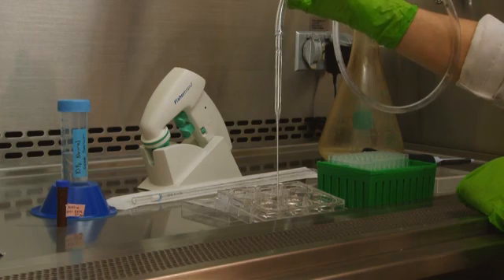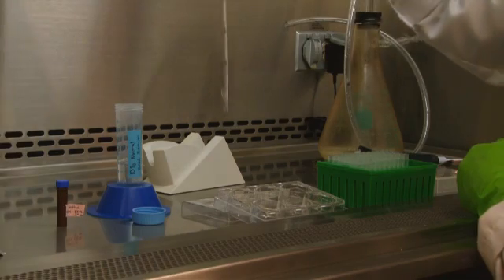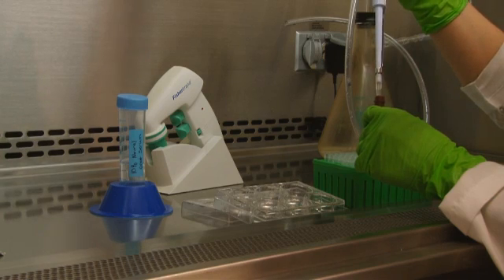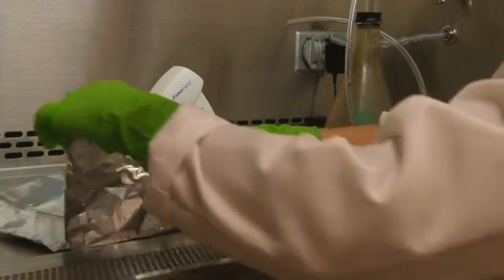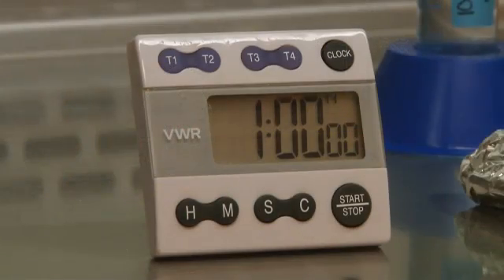Next, prepare the fluorophore conjugated secondary antibody, which will bind to the primary antibody. Dilute the secondary in blocking buffer at the recommended dilution specified on the data sheet, and incubate at room temperature for one hour. Covering the plates with foil prevents sensitive dyes from degrading.